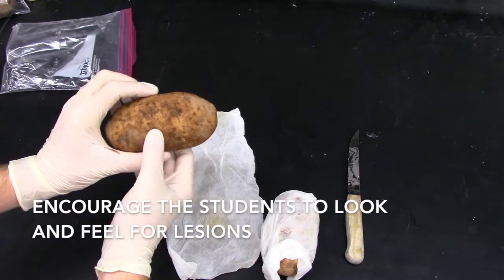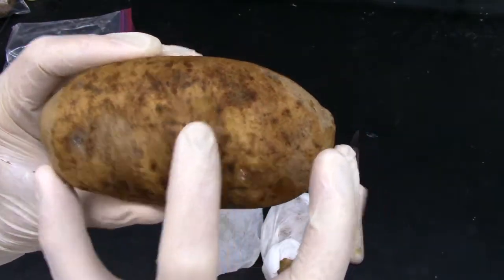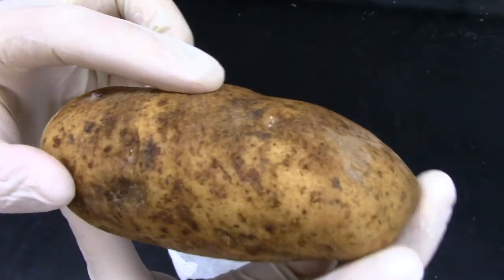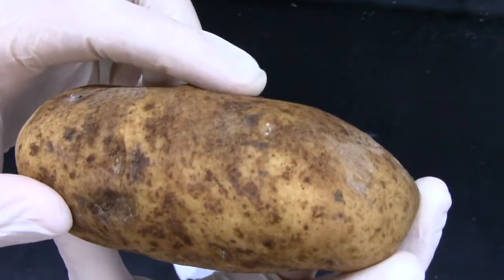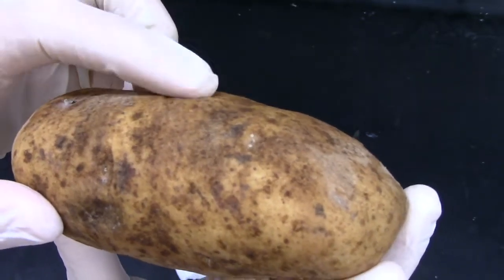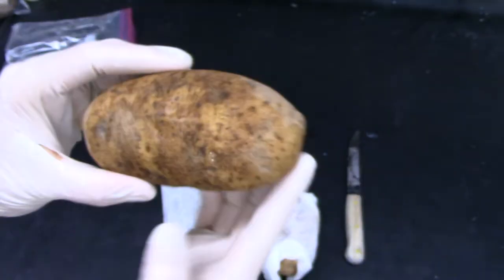So I inoculated here. I'll bring this up to the camera so hopefully you can see. It's a little bit hard to see, but this is very, very soft. I'll try and pull it up here. So you can see, there we go, that I'm able to push it and it's kind of squishy, like so. That means that the tissue under here is being consumed by the bacteria. The skin is still there, but it's very, very squishy, and it's a sunken lesion maybe about 2 inches wide.